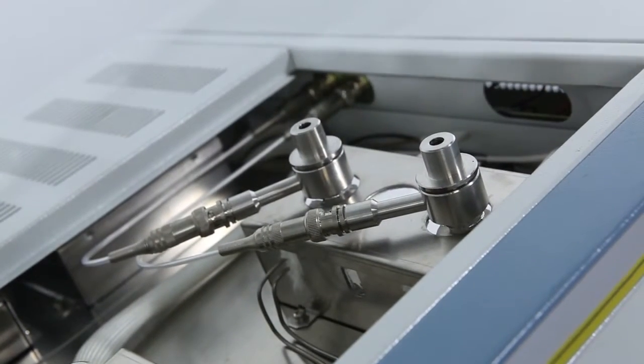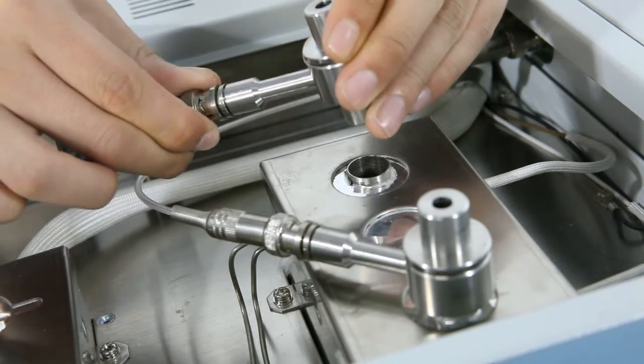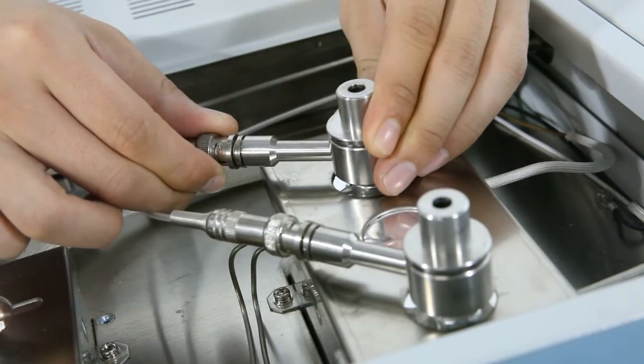The GC7800 gas chromatograph adopts modular design, which means simplified system structure, independent functions, convenient upgradeability, and easy maintenance.